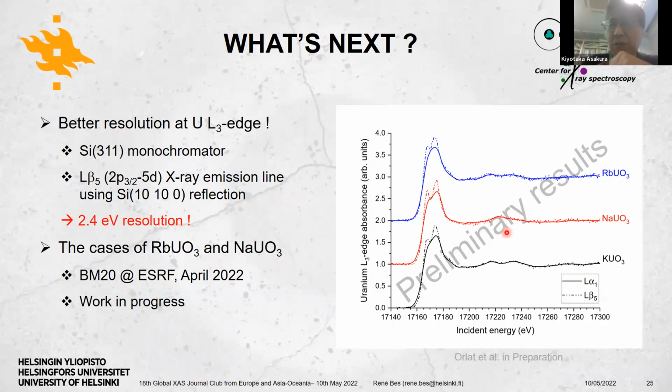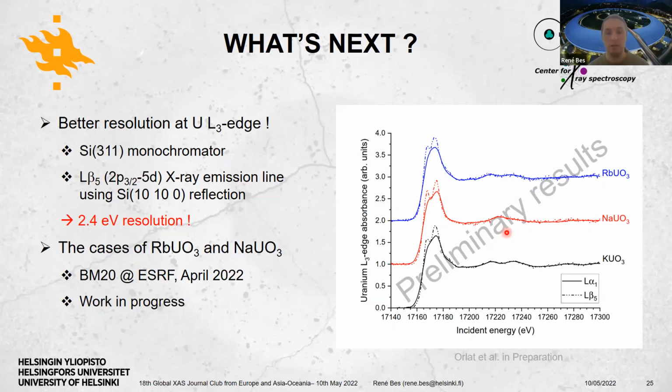So what I think is the sodium is highly distorted, therefore to me, it is natural that the broadening occurs in the sodium case, but the experimental result is different. So the sodium is a little sharper, even if it is so distorted. Rubidium and potassium are, on the other hand, broader, even if they are nearly perfect octahedra. So that is curious for me. Yeah. That's really counterintuitive, and that's why we are still digging into it, because there should be some other effects in the positioning of the d electrons in that case. Thank you very much. Yeah, very interesting.